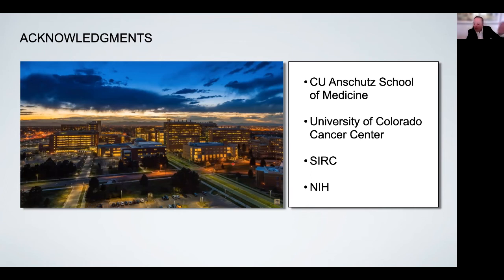So like the little soccer player that I used for one of my example slides, you have many, many soccer players in different orientations. And you take a picture in the microscope and you may have 200 or 500 individual molecules there, all in different orientations. Then you combine that information computationally to obtain a 3D structure.